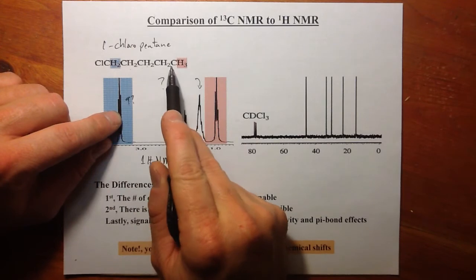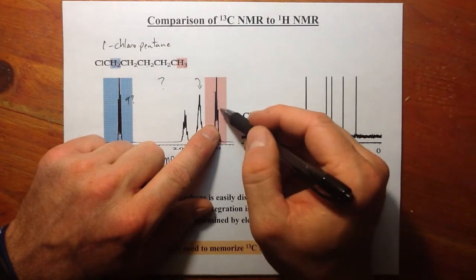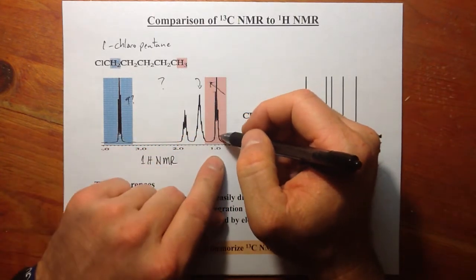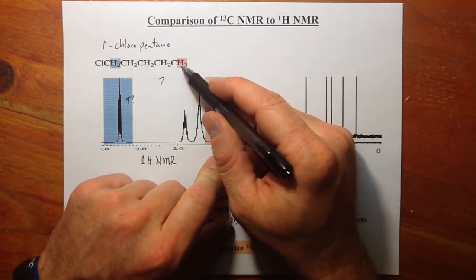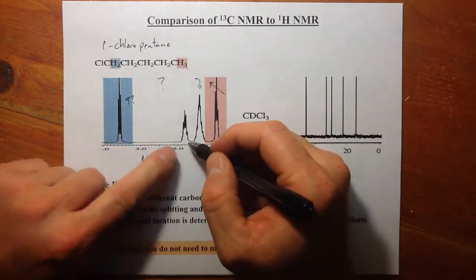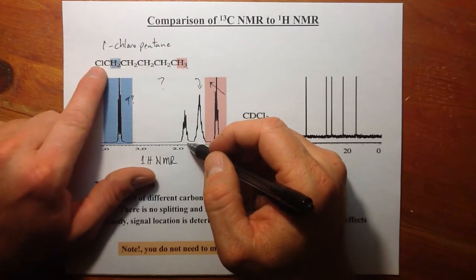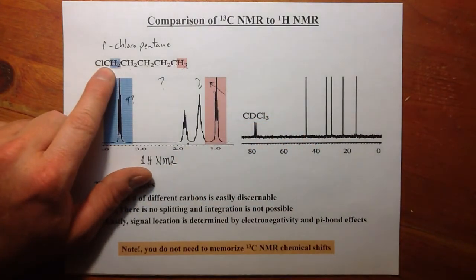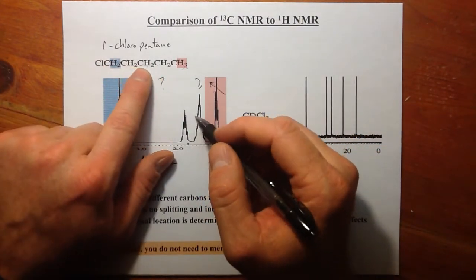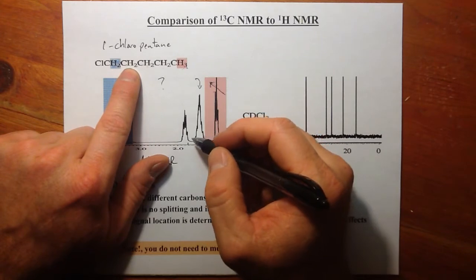And we'd say these pendant methyl groups tend to fall in just below 1, and we'd have a simple splitting, a triplet, with maybe some leaning towards whatever it's split with. But this is below 1. It's certainly most likely representing these 3 protons here. And we could argue, kind of coming from the downfield side again, that this signal here is really due to these protons that are feeling some sort of residual inductive effect of the chlorine. Again, this chlorine pulls on this carbon, and therefore this carbon is partially positive, which pulls on this carbon, and maybe that effect sort of tapers out when we get down to this point, but still affects this set, or these 2 protons. That might be this signal here.